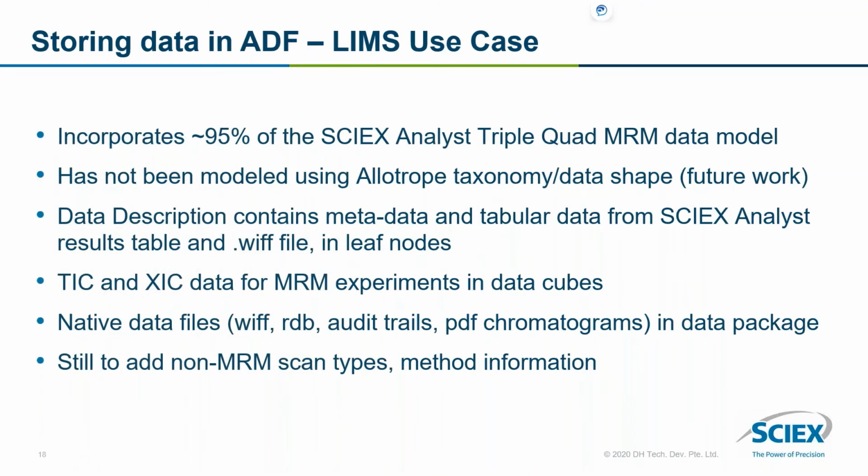The modeling for this use case includes most of the data from an MRM experiment. Haven't yet modeled it. This is actually for the archive use case, sorry. We haven't yet modeled it using the Allotrope taxonomy and data shape. The data description contains metadata and tabular data, TIC and XIC data in the data cubes.